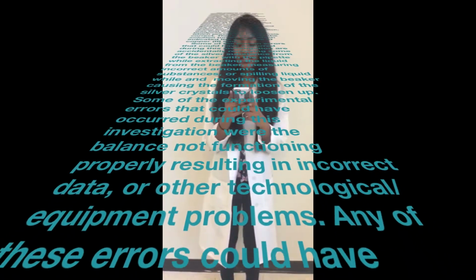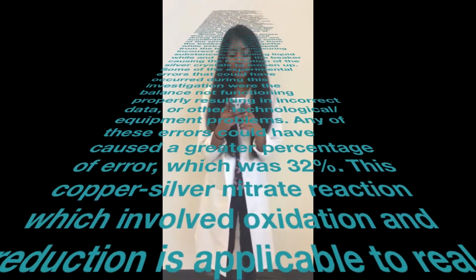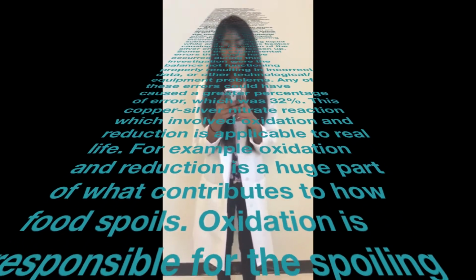Some of the experimental errors that could have occurred during this investigation were the balance not functioning properly, resulting in incorrect data, or technological equipment problems. Any of these errors could have caused a greater percentage of error, which was 32%.